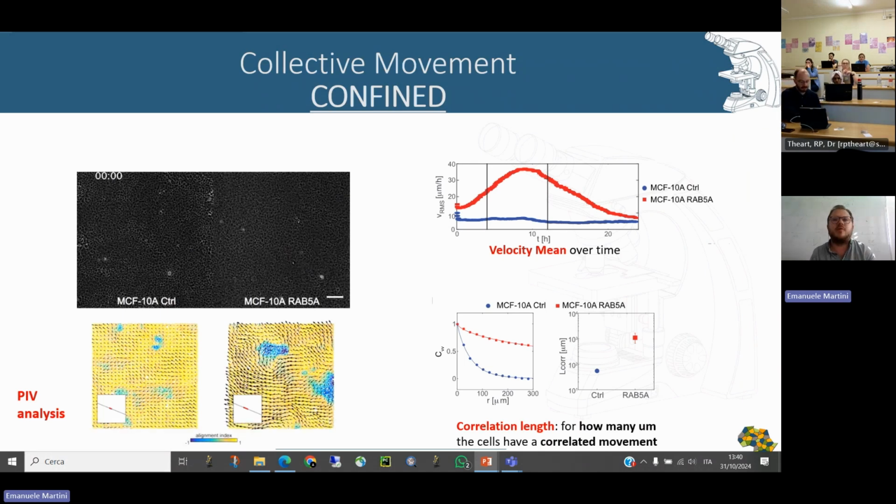It's really useful, and it's one of the reasons why this kind of approach is used, because it avoids the fluorescence sample preparation, it avoids using one of your markers to mark nuclei or something like that. You can use your experiment directly without any fluorescence. So it's label free, to be technically precise.